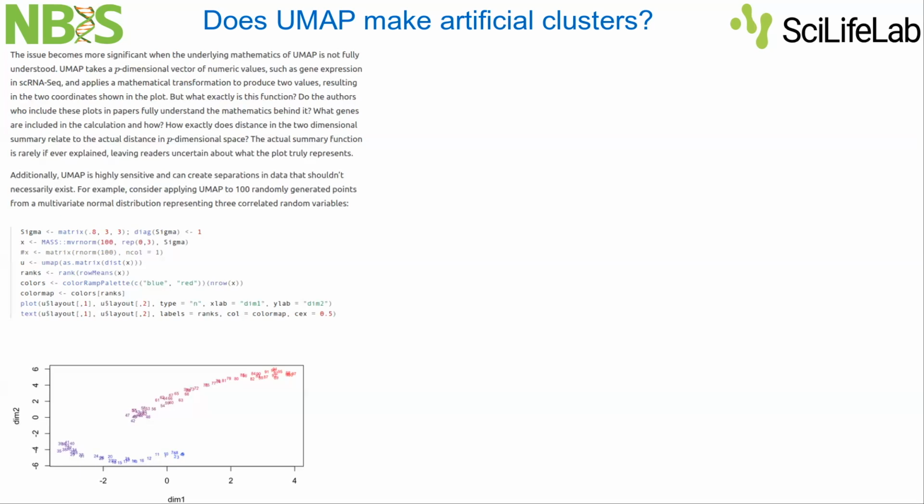Can I add to that? Absolutely, Nikolay. If you have two trajectories and you want to say that one is closer than the other, for instance, it depends a lot on how many cells you sampled along the two trajectories, and how dense they will become in the UMAP also. So basically, you can't really say much about the distances.